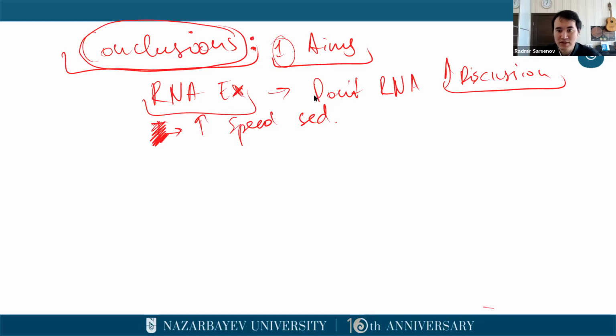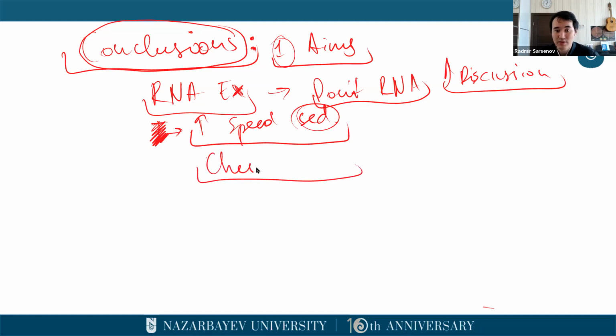So first, you did not achieve, you did not get any RNA. Second, for the next time, you want to speed up the centrifuge. And third, let's say that you keep the chemical, is kept because you don't see any difference with the chemical that you actually are replacing.